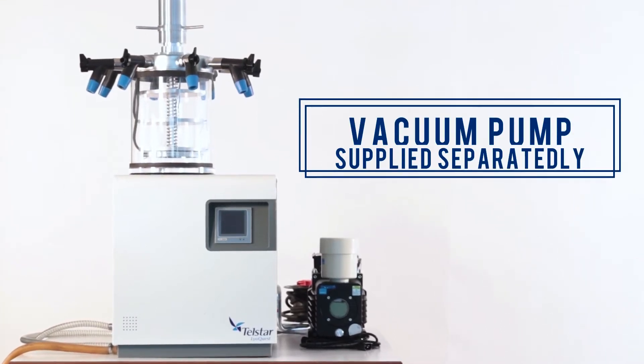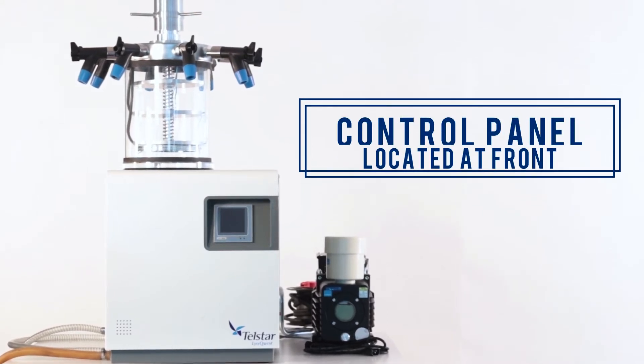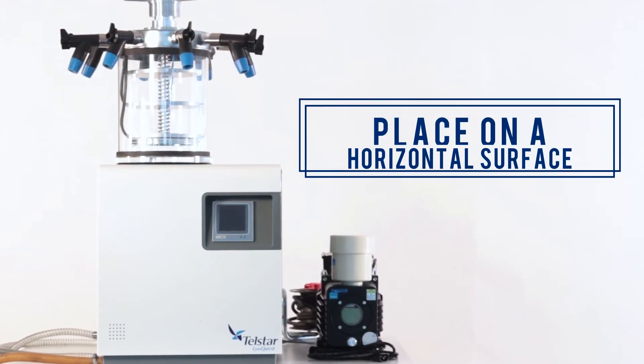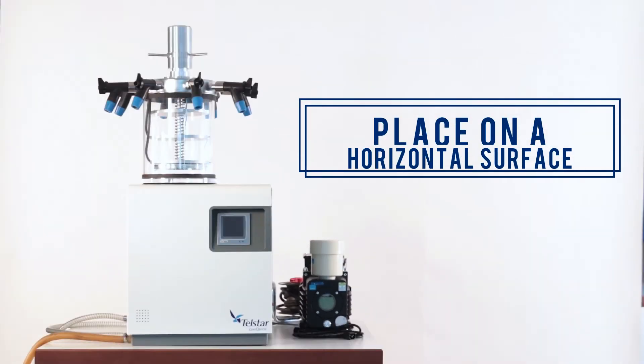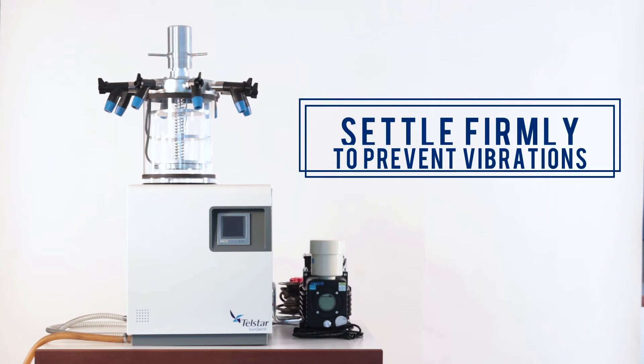The vacuum pump is supplied separately as an optional. The control panel is located at the front. The unit must be placed on a table with a smooth horizontal surface. The basic unit must be firmly settled to prevent vibrations.